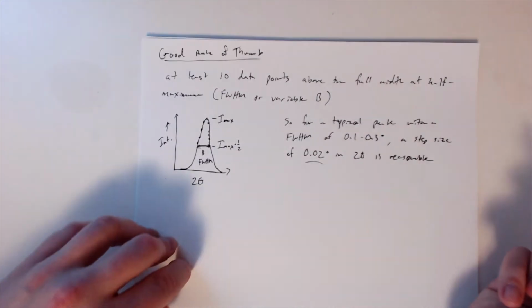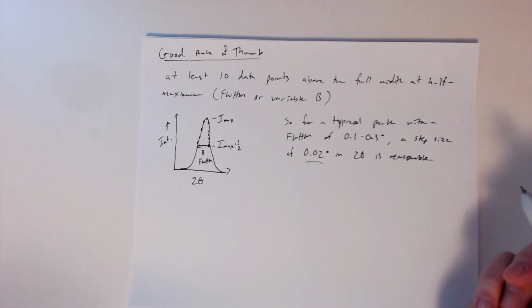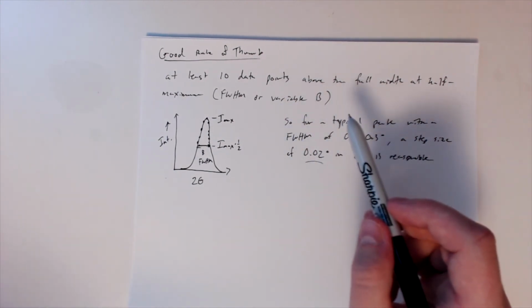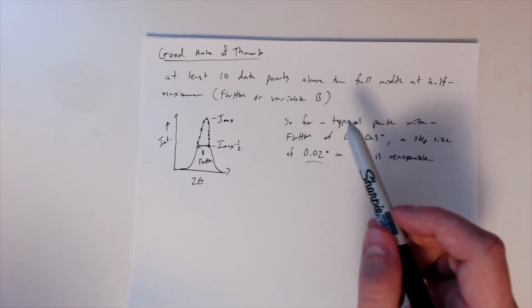This kind of step size is pretty common to have a good measure of the peak.